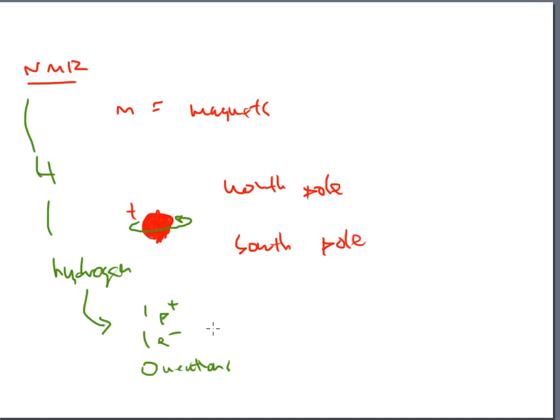So this pretty much is a very simplistic way to look at what these atoms are going to do. And because it's just really a proton at this point, and that's it, that makes the NMR, as far as description goes, a little bit easier for us. Plus, hydrogen's everywhere in the molecule, like we've talked about before. So there's tons of carbon to hydrogen bonds, tons of them.